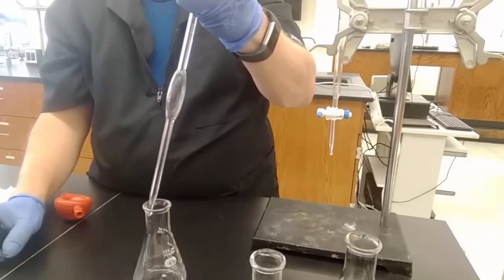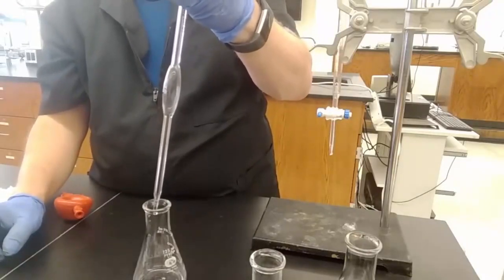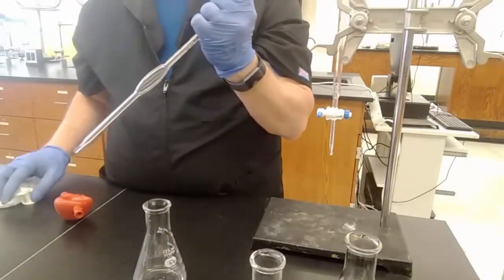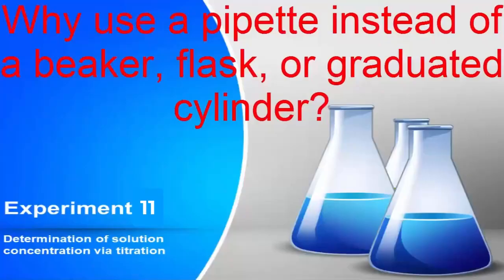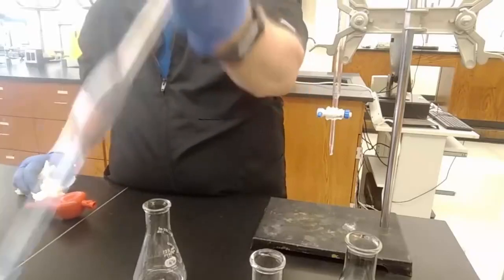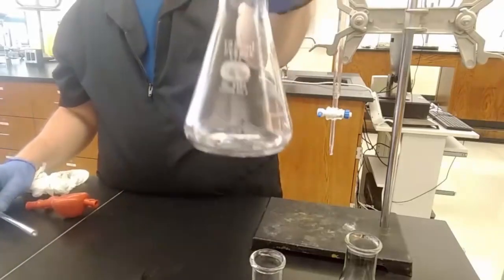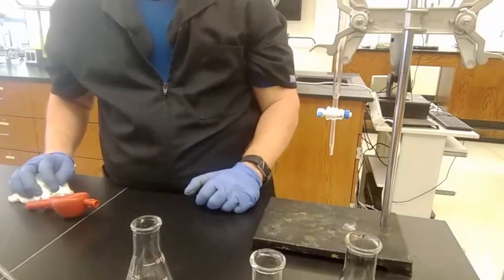So, to answer the question in the book, why is it necessary to use this pipette instead of a beaker or a flask or even a graduated cylinder? The answer is because this is plus or minus 0.02 milliliters. Plus or minus 5%, like a beaker, and then a graduated cylinder, even a good one.